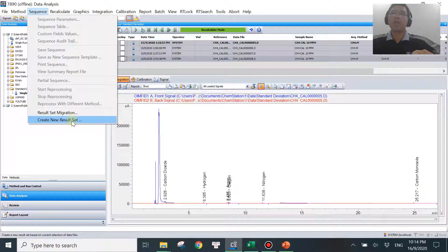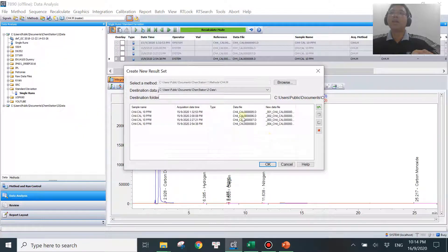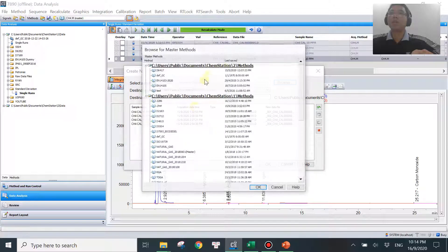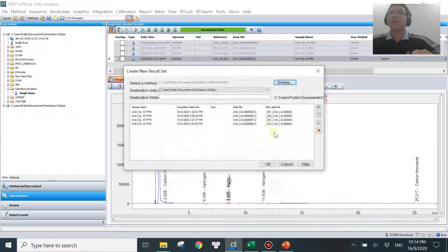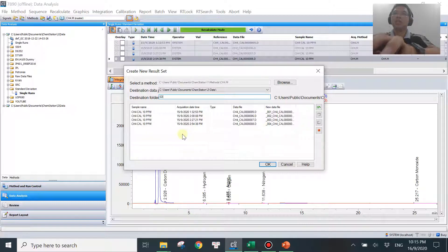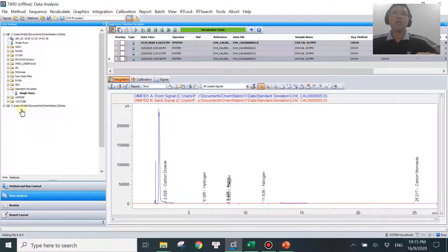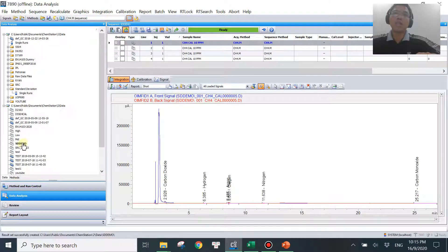Select 'Create New Result Set', hit this button. First, browse for your method — in my case it's me10.m, which is correct. If not, hit Browse and select the correct method. Then set the destination folder — I'll call it 'SD demo'. Include all four data files and hit OK. You'll see a new folder called 'SD demo' created. Double-click on it and the four data files you selected will be showing up.